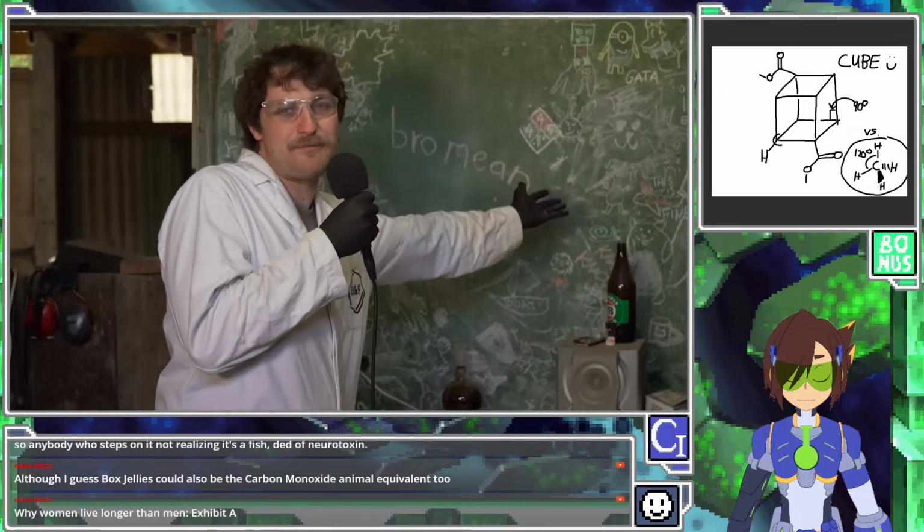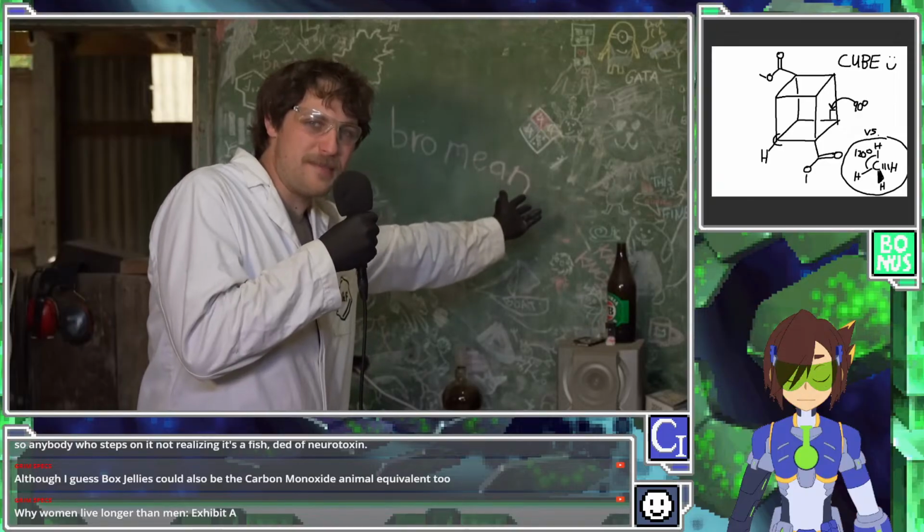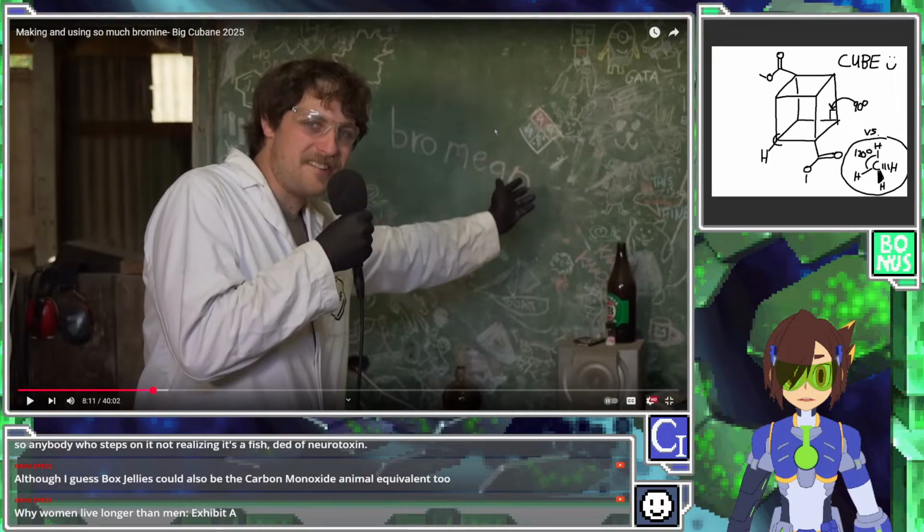I bought 2 liters from a chemistry supplier a little while ago. It's a little bit of cheating, but I do have the dichloromethane. To be fair, with his own little challenge there, he has shown in videos before that he got dichloromethane by buying some paint stripper at his hardware store that comes in this awful gooey canister, and then distilling it in a distillation apparatus to collect the dichloromethane on the other side, which works and gets it pure, but it does also take a lot of time.